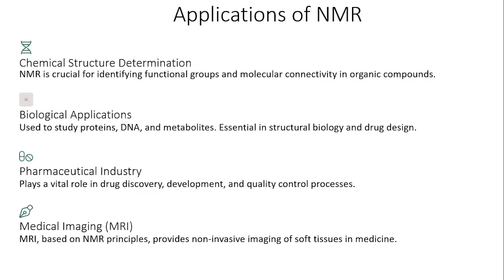NMR has extensive application in various fields. In chemistry, it is used to determine molecular structure. By analyzing the unique chemical shift values and coupling patterns, chemists can identify functional groups and establish molecular connectivity. In biology, NMR is applied to study biomolecules like proteins and DNA.